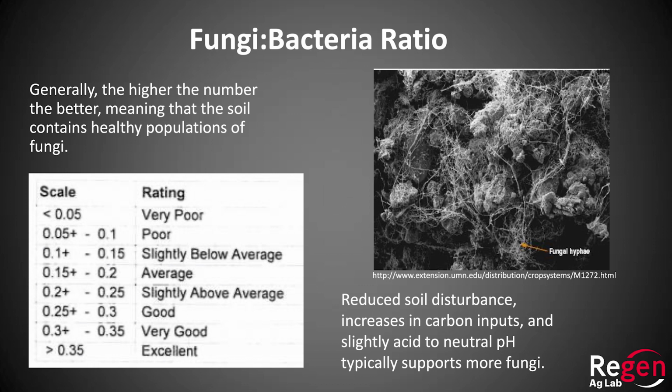And the issue is that whenever we talk about this, you hear a lot of different things about fungal to bacterial ratios. Has anybody heard of the fungal to bacterial ratio before today? Okay, and usually when people talk about it, they want a 1-to-1 relationship. Equal parts fungus, equal parts bacteria. Using PLFA as a measurement tool, you will never get 1-to-1. The reason is because bacteria have a larger amount of phospholipids per pound, or whatever you want to say, than fungi do. So it's an unfair advantage that we add weight to fungus. That's the reason why our scale says 0.25 or 0.2 to 0.25.